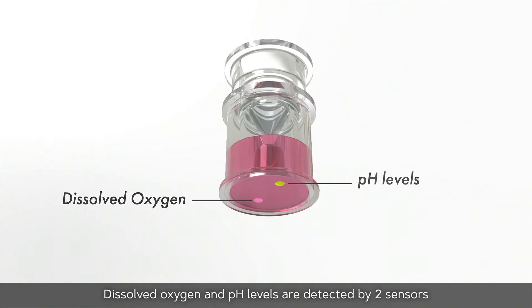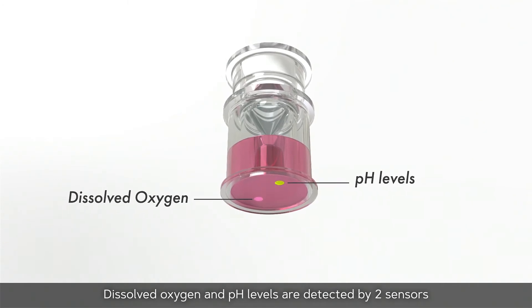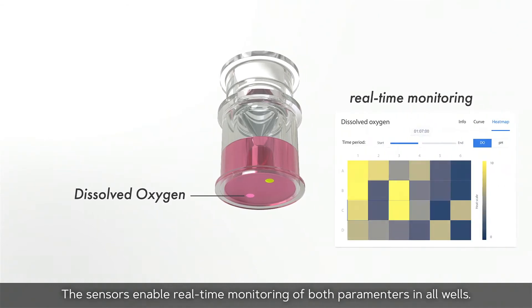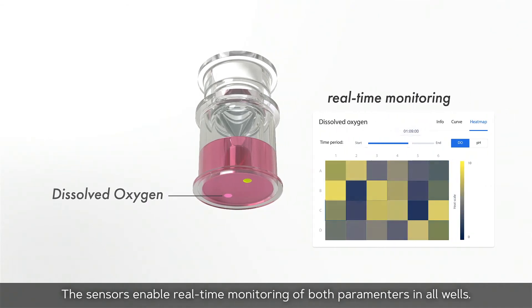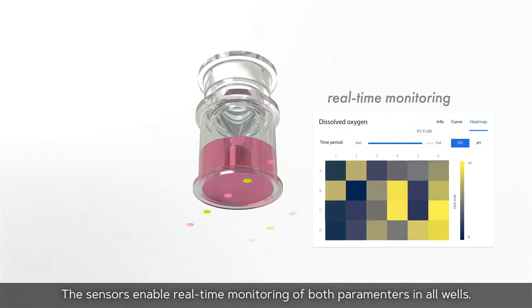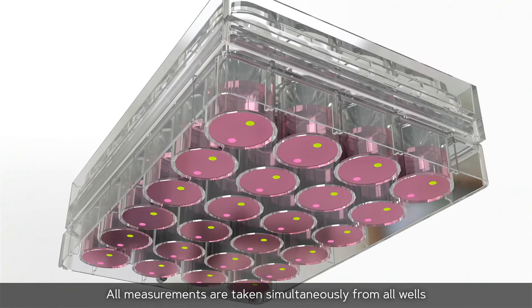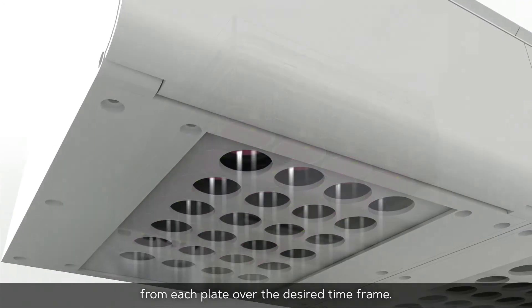Dissolved oxygen and pH levels are detected by two sensors attached to the bottom of each well. The sensors enable real-time monitoring of both parameters in all wells, with all measurements taken simultaneously from all wells on each plate over the desired timeframe.